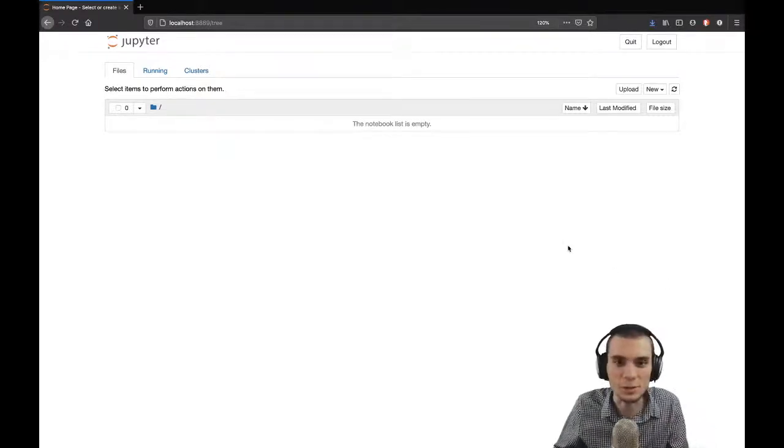Hey guys, my name is Jonathan Wheeler. I've just set up kind of a studio in my garage that I can use for sharing my screen, making tutorials, making presentations. And what I've got for you today, I'm going to share with you how I use PyTables to record scientific data that I get out from the lab.